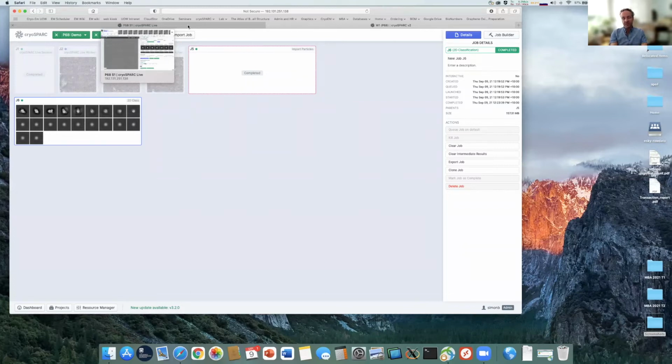And so once we get deeper into it, we can actually just use this same cryoSPARC setup to go and do further processing. If you wanted to take that and do the 3D thing, you can do that later on offline or? Yeah, I mean, we'll do it online today, but yeah, we would continue processing using this data, which has already been processed in Live. Most of our customers like to go and reprocess somewhere else.